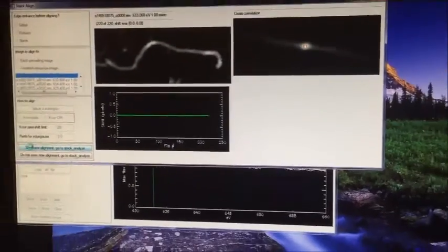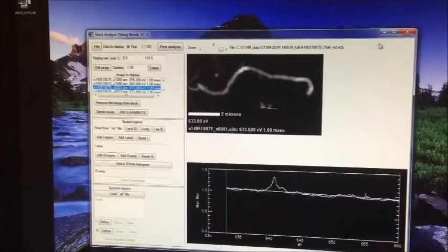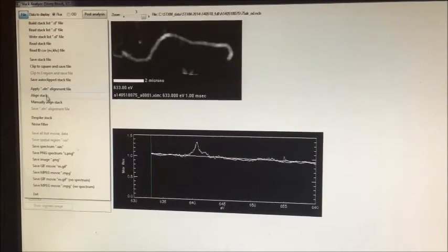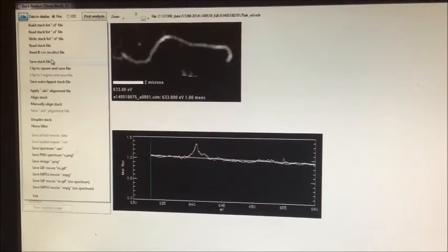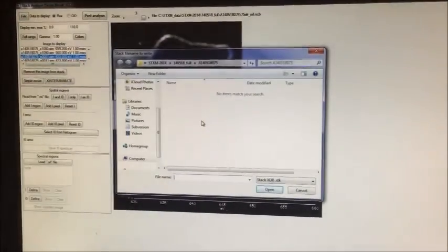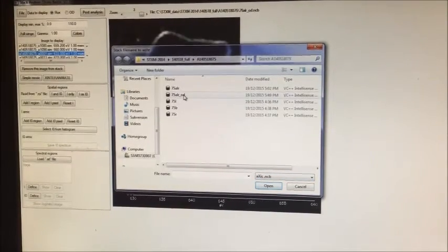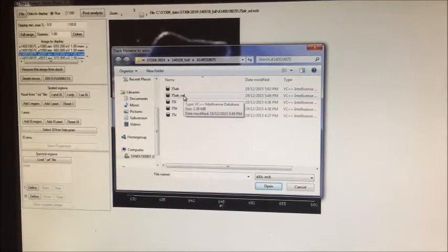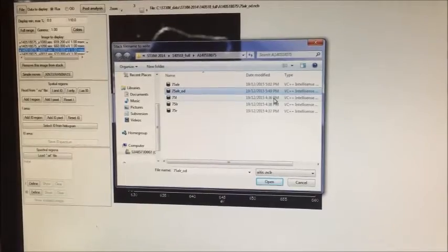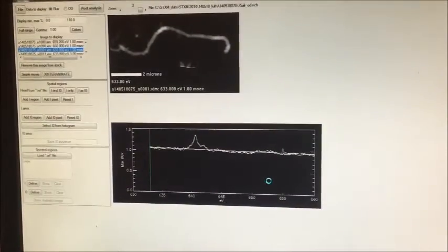Okay, done. Save it. Now save this file again. You can save this to the... so to do that, go to save stack file. We have done it previously, and click on axis.ncb, and we are going to save it in the same folder to avoid multiple files. So click on that, the same old file, then click open, which means you are saving the data.